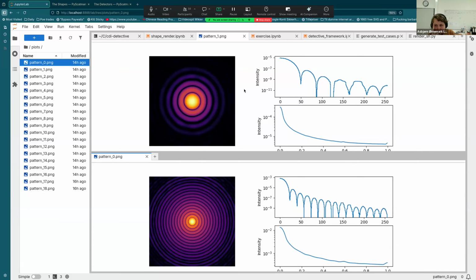I think mathematically, if you soften it, because this can be seen as you are Fourier transforming, right? If you soften it, you can think of that as convolving the sphere with a Gaussian. And if you do this, then your Fourier transform is also multiplied, right? This convolution theorem for Fourier transforms, by this Gaussian. So what should happen is that it should broaden out a little bit, but it also looks like there's some beating happening.